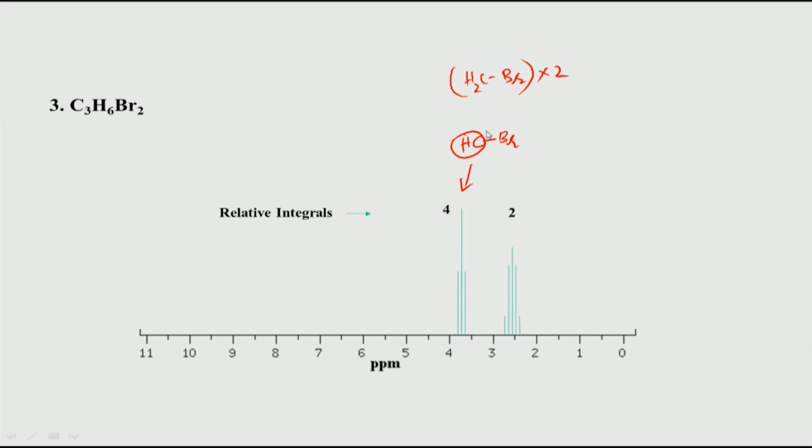That is why we are getting these 4 peaks, but then there is a triplet here. What it means is this CH2 has to be coupled to another 2 hydrogens, only then you expect, according to the n+1 rule, that this will be a triplet. So, this whole unit is coupled to a CH2, and that CH2 could be this, because there are 2 hydrogens.